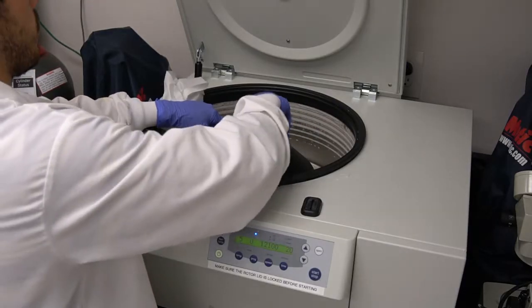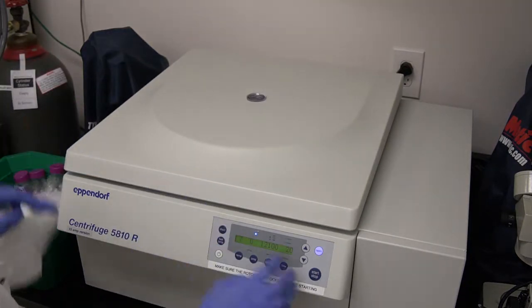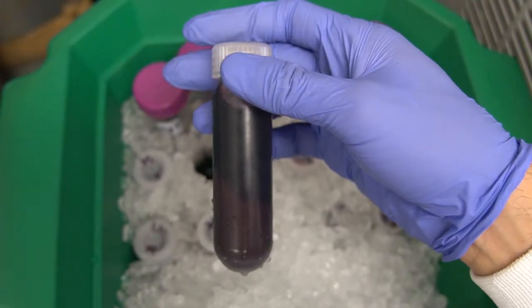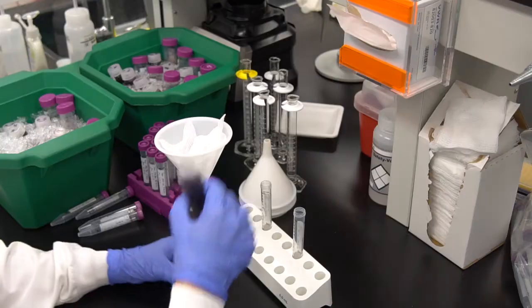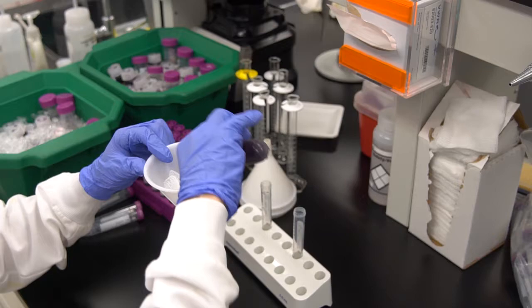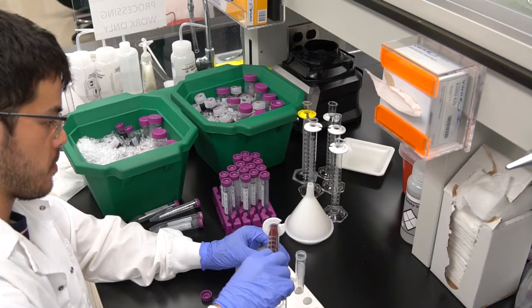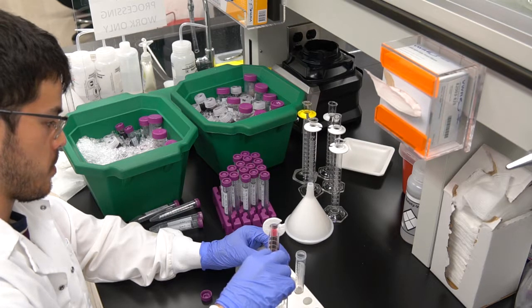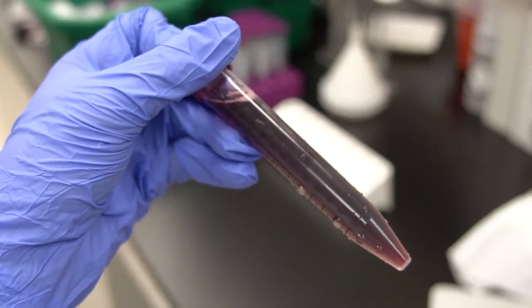Before moving on, the homogenate needs to be centrifuged to separate seeds, pulp, and skins from the juice inside. So now the seeds, pulp, and skins have been separated from the juice. To prevent any pulp, seeds, and skins from remaining in the sample, the juice has to be filtered with a cheesecloth. The total juice volume is measured and stored in 15 milliliter tubes at -20 degrees Celsius. Now the juice is prepared for soluble solids and titratable acidity tests.